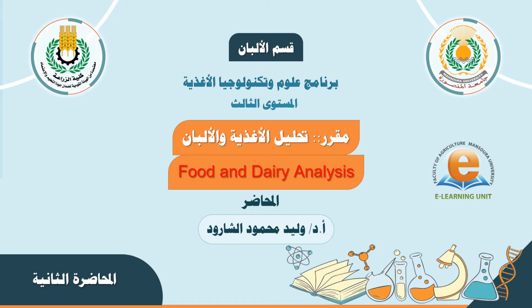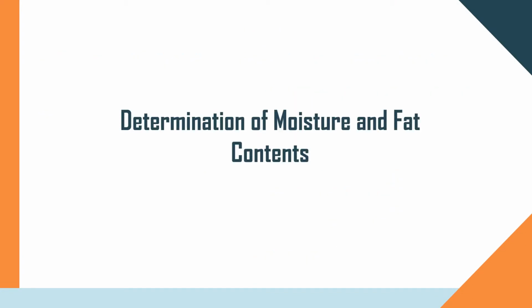Hello, everybody. I would like to welcome you to the second lecture in the Food and Dairy Analysis course. Today, we are going to discuss two topics about the determination of moisture and fat contents. In each topic, we are going to discuss both the technical importance of the component under study, whether it is moisture or fat, and then we will discuss the methods used for the determination of moisture or fat.